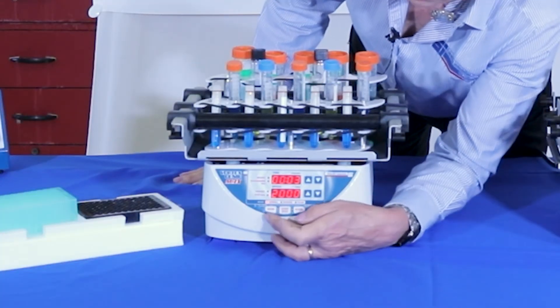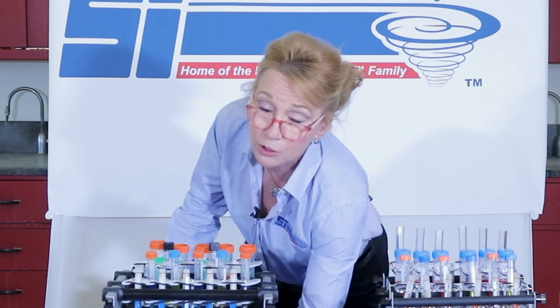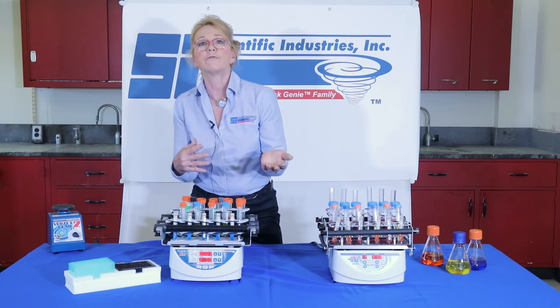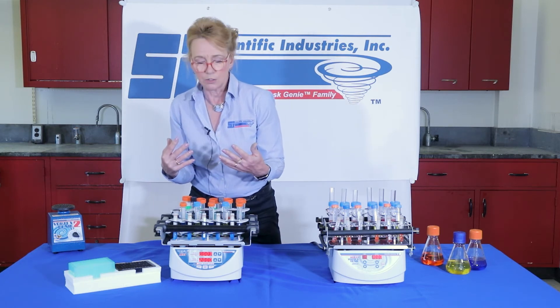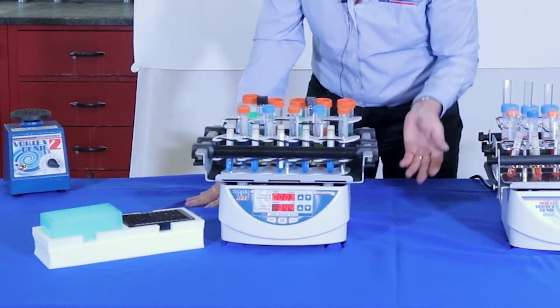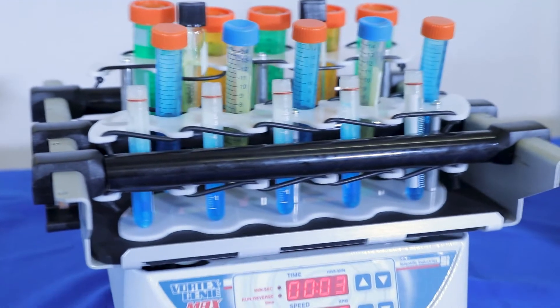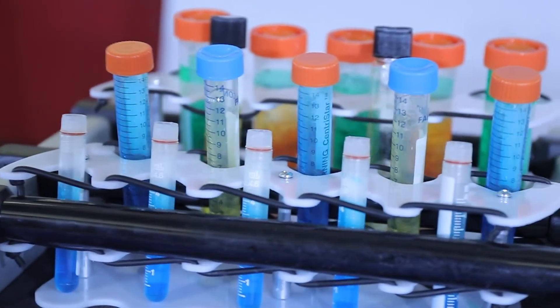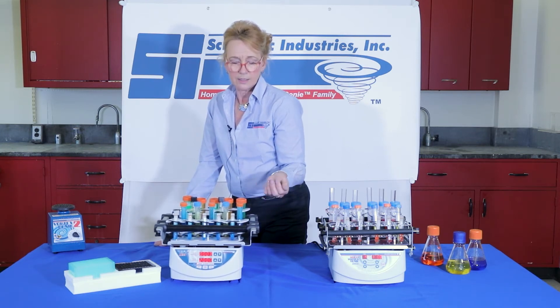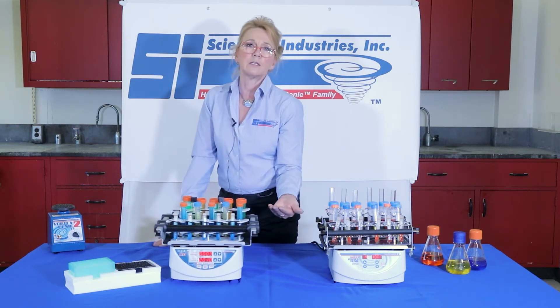Right now we have it in normal mode, which is just run. We also have a function for reverse mode and a pulse mode, which is an on-off total cycle time or continuous. Let's take a look at it in normal mode. We'll just turn it on at maximum speed — 2,000 RPM. Whether it be a smaller tube around 3–4 ml, 15 ml tubes, chemistry glass tubes, or 50 ml tubes, each and every one of those is pulling a very nice vortex.